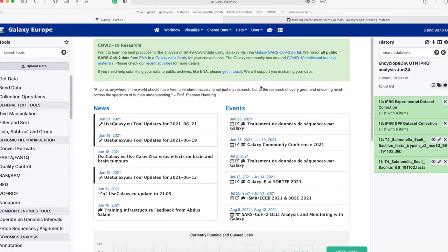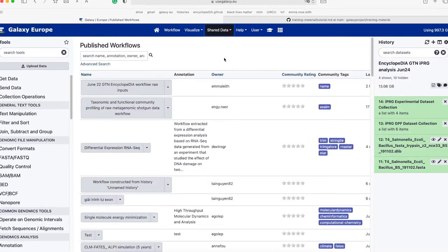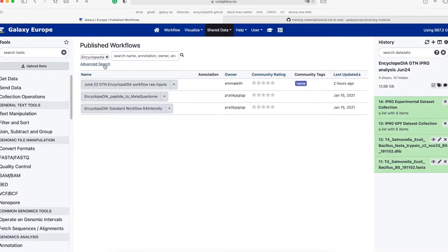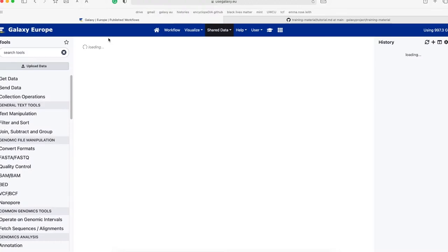Now that we have uploaded the data and created the dataset collections, we will upload the workflow. Go to 'Shared Data' and then 'Workflows' at the top of the screen. Use the search bar and type in 'Encyclopedia.' The workflow we are going to use is labeled 'June 22nd GTN Encyclopedia Workflow Raw Inputs.' We can use the drop-down arrow and click Import to import the workflow to our list of workflows.